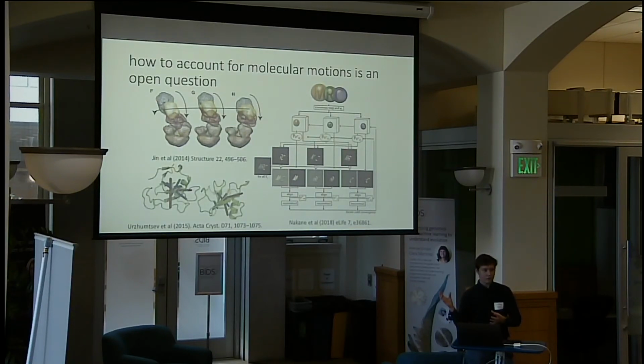None of these are very good approaches for looking at dynamic motions, very large motions, and none of them are really good at answering questions if the question we want to ask is about this short-lived state. All of these techniques are good at answering questions about the major states and very poor at answering questions about transient states, which are very often the most functionally interesting.